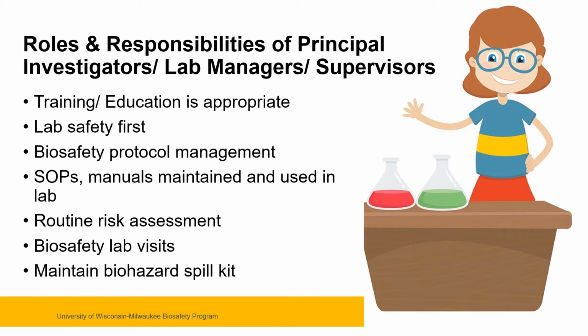It is your responsibility to manage biosafety protocols and submit them as necessary for biosafety and IBC review. It is the responsibility of the leaders of the lab to maintain standard operating procedures, biosafety manuals, and any other important information necessary to provide a safe working environment. It is the responsibility of the leaders to schedule biosafety lab visits and remediate issues that may arise from those visits. It is also your responsibility to maintain a biohazard spill kit in your laboratory, as well as a clear biohazardous spill standard operating procedure.